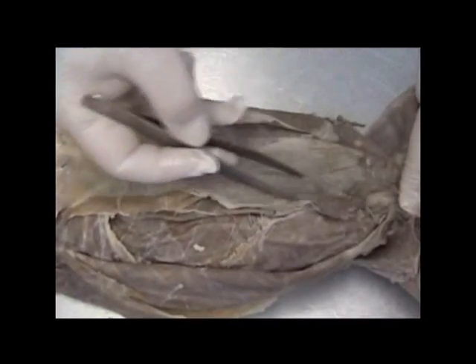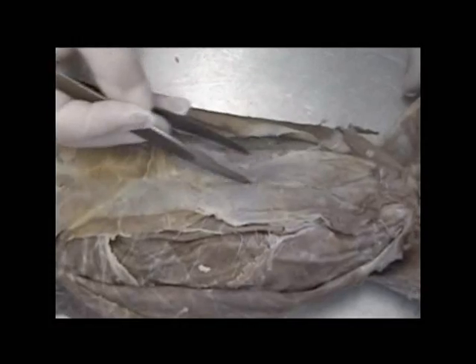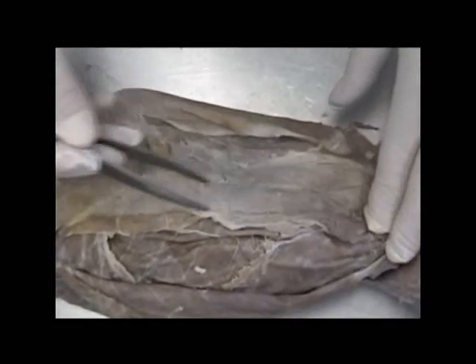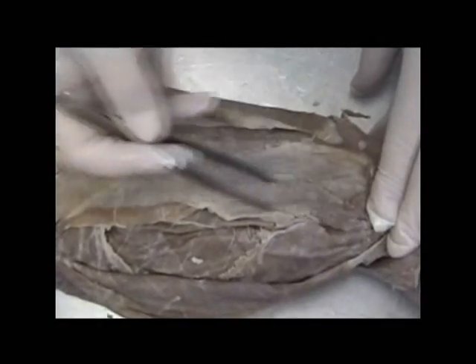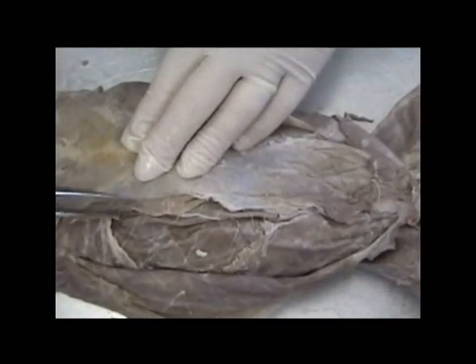Now, this sheath of connective tissue here also covers two very long muscles that run from the groin region all the way up to the ribs and sternum, and you can see a hint of that. You can see an edge of them along here. Wide banded, very long muscles, and this is the rectus abdominis muscles here and here. Again, still partially covered, although we see some of it here.